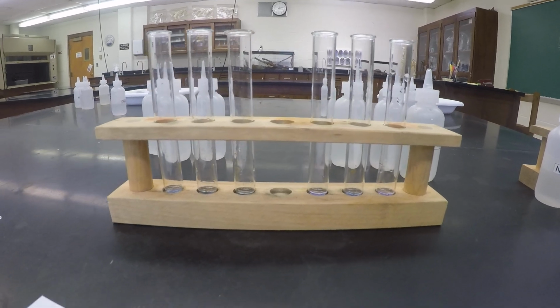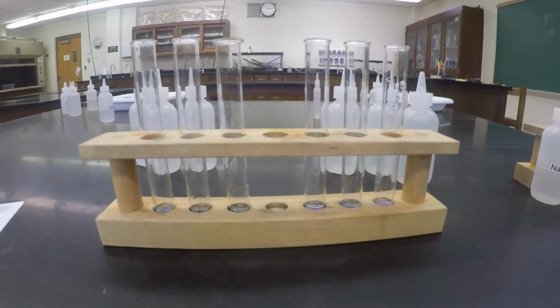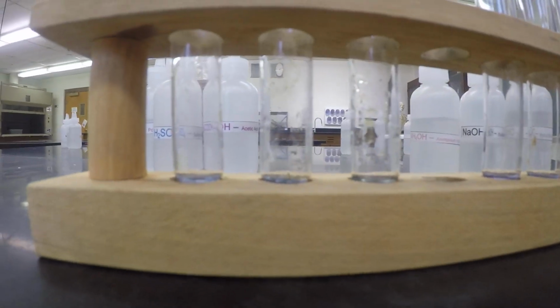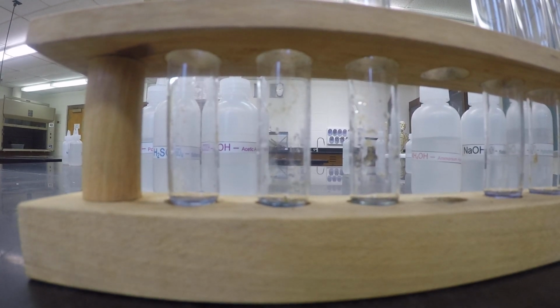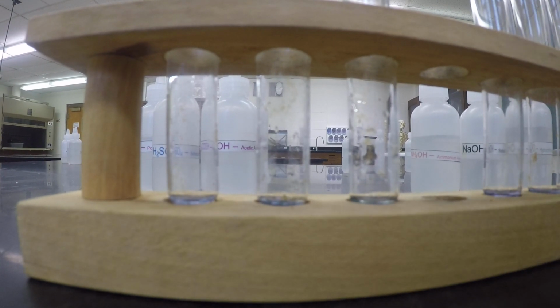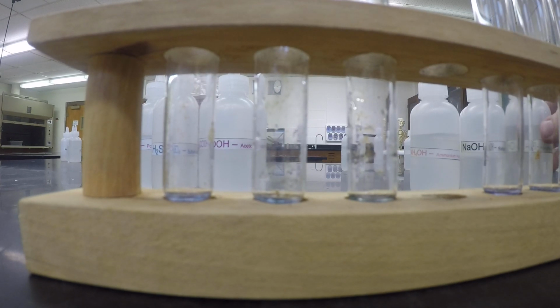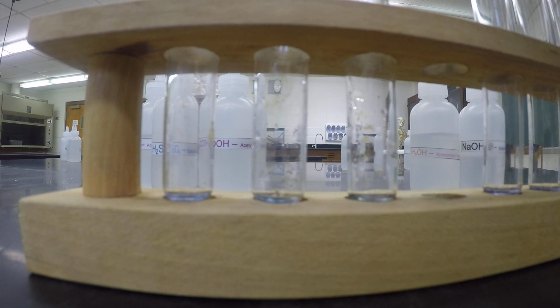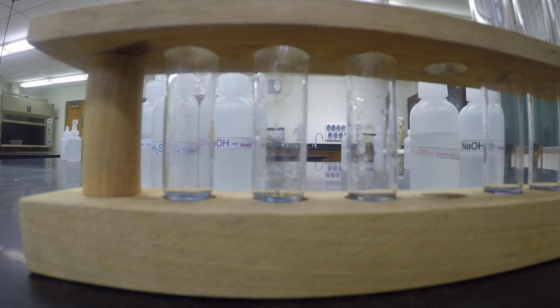So what you're going to do on part 4 is you're going to tell me what color the indicator dye changes the specific acid or base. So on these first 3, I'm going to put the acids. So for this first test tube, I'm going to add 10 drops of hydrochloric acid.